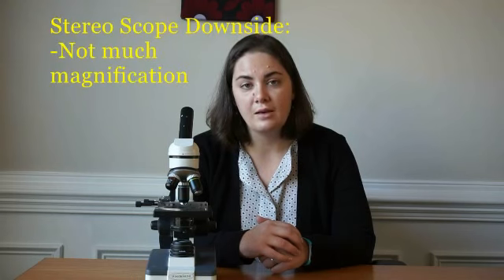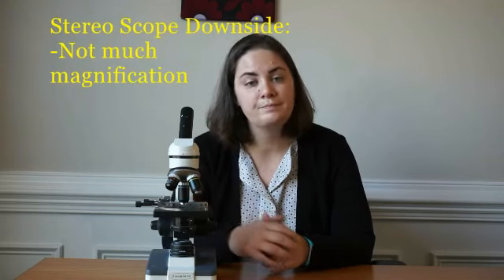Unfortunately, the downside of the stereo microscope is that the magnification level is only up to about 50 times. This may seem like plenty of magnification, but for upper level science courses like high school biology and some middle school life science courses, they'll need to be able to focus and see on a cellular level, which will require a compound light microscope like this one.